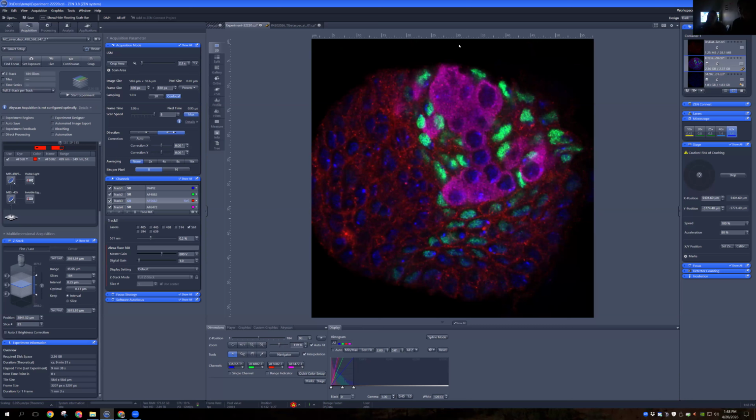I got connected to Shadow the Scientists through Jess primarily. And when I heard about how it started with astronomy, I definitely had the same thought. I basically do the same thing. I'm using a computer to operate this very big machine, and I can share my screen and show you. So I was really excited that there is this parallel: some things are very big and far away and some things are very small and up close, but the way that we can share them with each other and with people around the world virtually is very similar. And so I really like that connection.